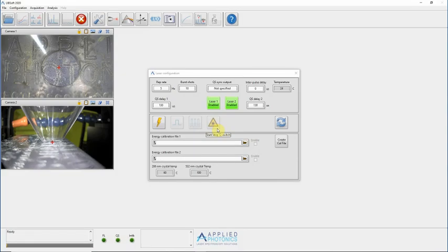The parameters displayed in this window for the Lightron Bernoulli laser are slightly different to those displayed for other lasers. This is because the Lightron Bernoulli actually comprises 2 lasers, some of the parameters for which need to be configured separately. This means that the configuration parameters are essentially duplicated. There are also a number of additional controls.